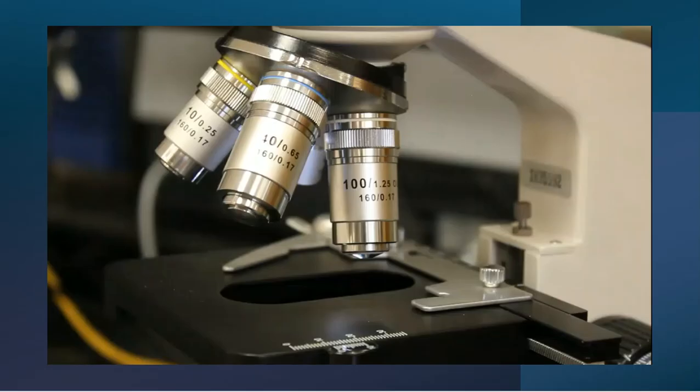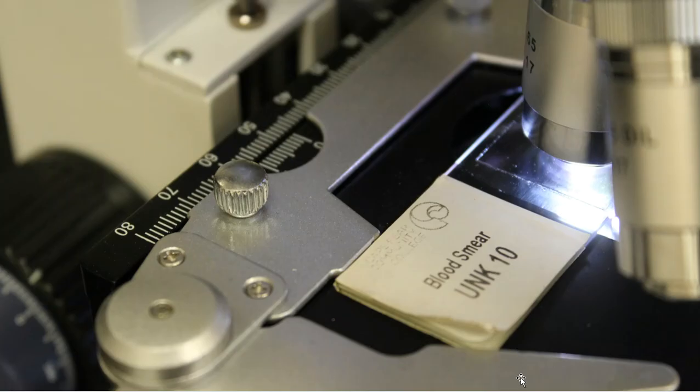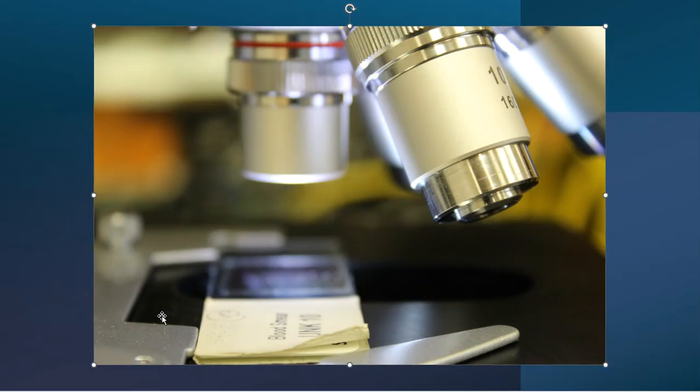Here's another picture of the microscope slide, and this is the clip that you're seeing here at the very bottom that is holding the slide in place. Once more, on one side, the slide is in the 90-degree cutout angle of that metal piece that you're seeing here. And on the left-hand side, when we're using the microscope, that clip secures it into place. And that's really what we're wanting, so that it doesn't move around when we move the platform.